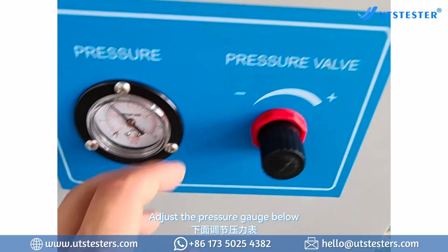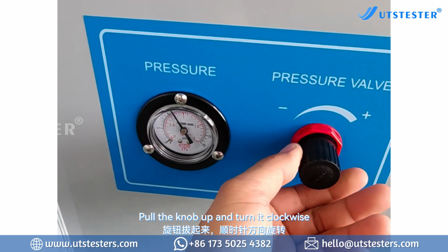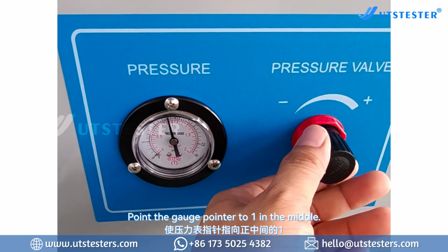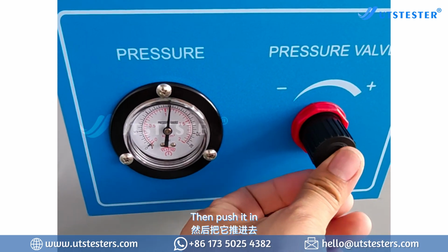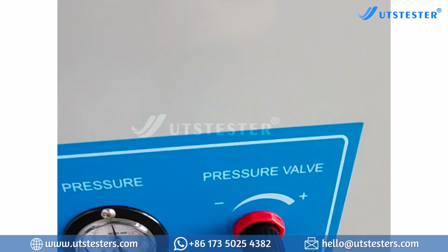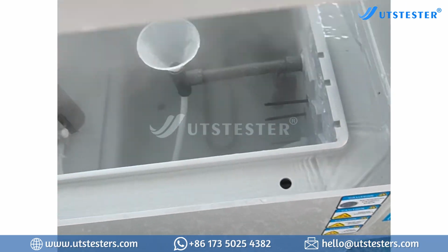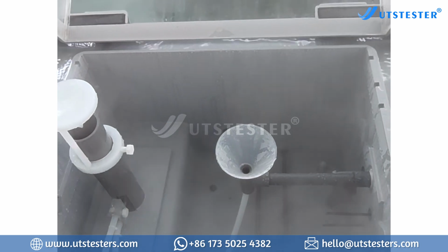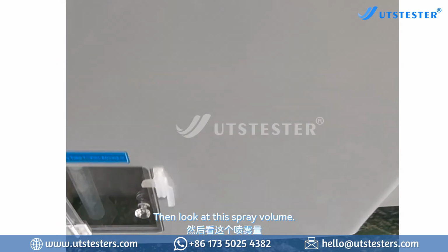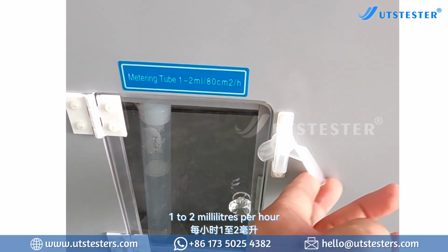Adjust the pressure gauge below. Pull the knob up and turn it clockwise. Point the gauge pointer to one in the middle. Then push it in. Now the test chamber is spraying. Then look at this spray volume: 1 to 2 milliliters per hour.